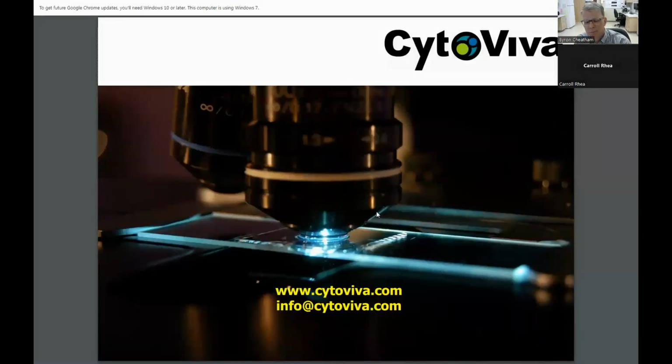They can even create these chips so that they can mimic the vasculature for a simulated in vivo type of experiment. I'm not an expert on that. The people at CytoViva are. We can provide that environmental chamber as part of a system, or you can acquire it directly from CytoViva. But there are ways to keep your cells happy and healthy so that you can look at them on a time-lapse basis to look at things like how nanoparticles may be taken up by cells or affected by cells over time. Wonderful, thank you.